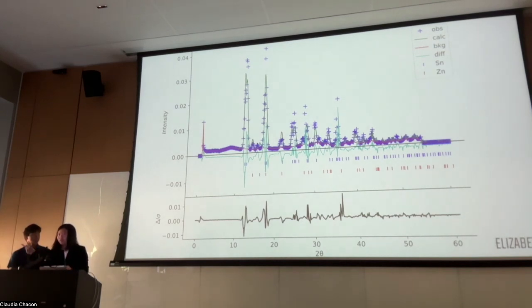And so second, the other reason is that the pattern we just saw at those two strongest peaks is consistent with preferred orientation. And so what this means is that the tiny crystal pieces in our sample might not all be facing in random directions. So some directions might show up more than others.